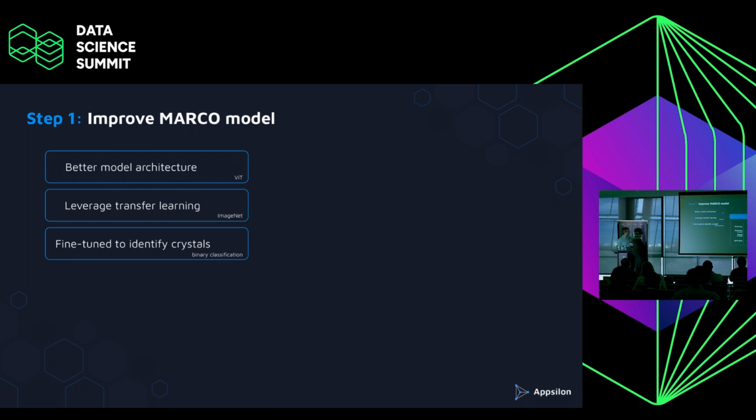And yes, we can. Before we go into the results, the few key improvements that I think contributed the most are: one, we've used the transformer model and not the inception-based model that was used in the original result. We've used the pre-trained model instead of training from scratch because that's what you should do in computer vision. We also adjusted what the model should look at, because the model is actually not judged by its accuracy. It should be judged by its recall.